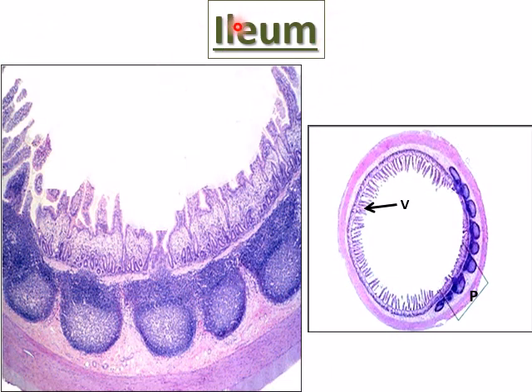Here is the ileum, a large rounded structure with a lumen. Between the lumen, villi and crypts, and the muscle layer at one side, there is a collection of lymphatic follicles known as Peyer's patches. Again, here is a rounded structure with a lumen. I can see villi and crypts. So it is one of two, duodenum or ileum. This is ileum. Why? Between the villi and crypts and the muscle layer, at one side, there are the Peyer's patches, which are aggregates of lymphatic follicles.